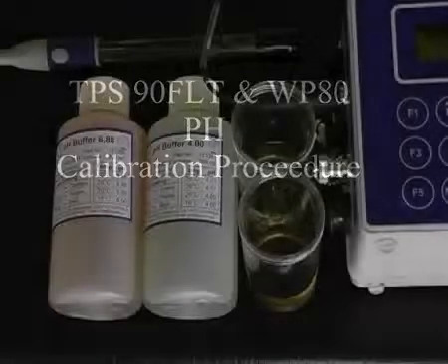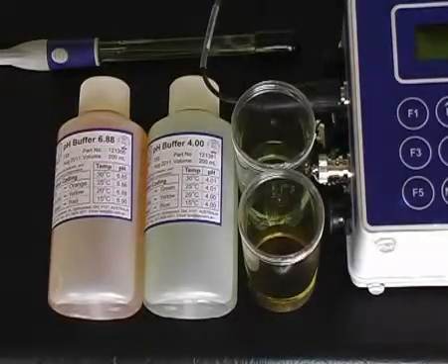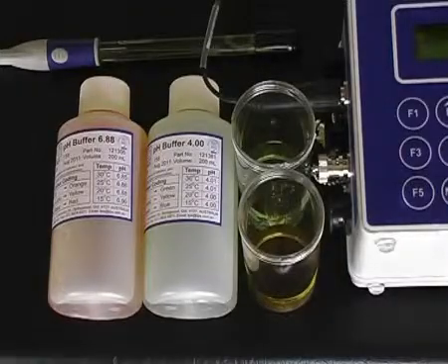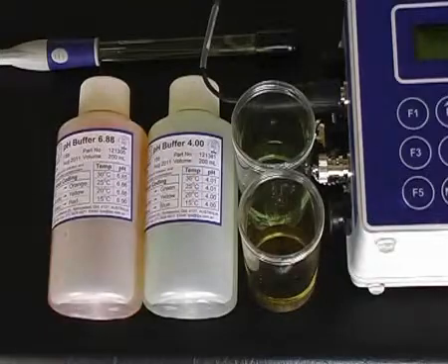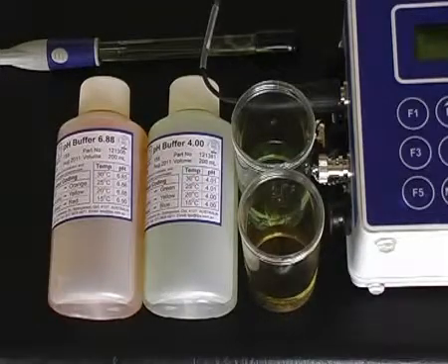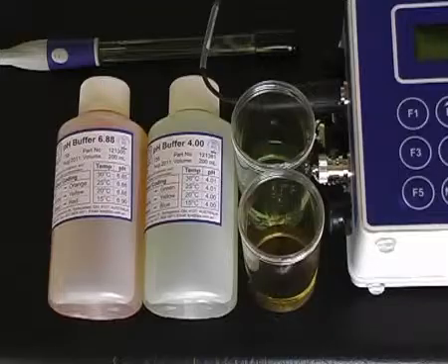The 90F-LT is supplied with calibration solutions. To calibrate the pH, two calibration solutions have been provided: a pH 6.88 and a pH 4. These solutions have been poured into separate jars so that we can place the sensor in there for calibration and ensure the sensor is submerged at least 30 mm in the solution.